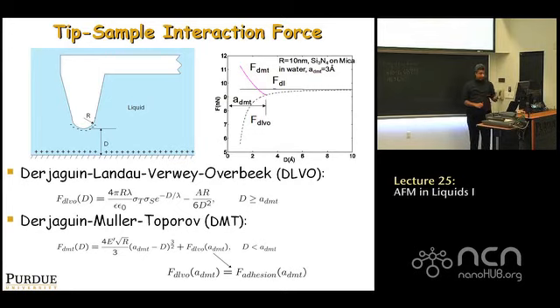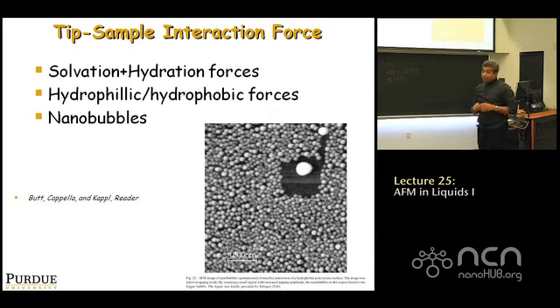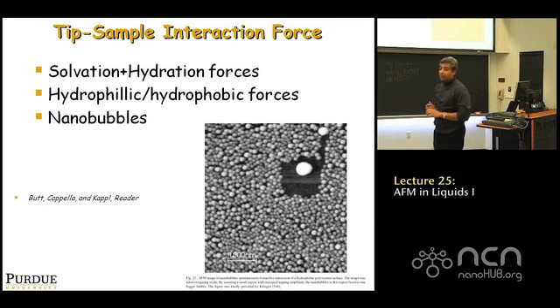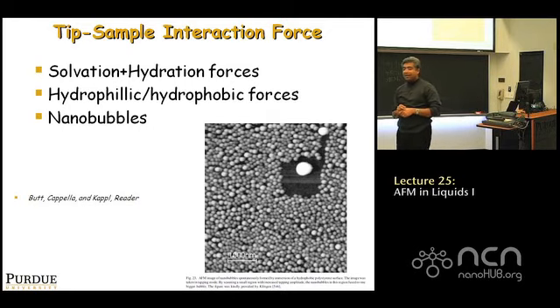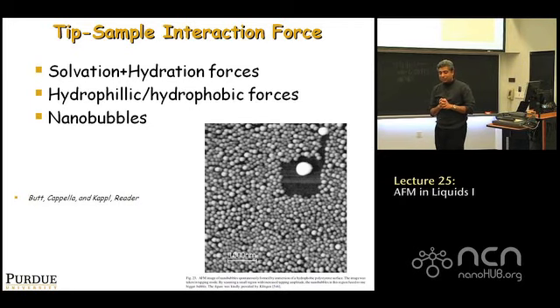Again, this is simply a mathematical statement of those interaction forces, the same formula as I showed you. Let's talk a little bit about what other forces are possible in liquids. One very important force in liquids, which we won't have too much time to talk about, is solvation and hydration forces. Let me tell you a little bit about them.